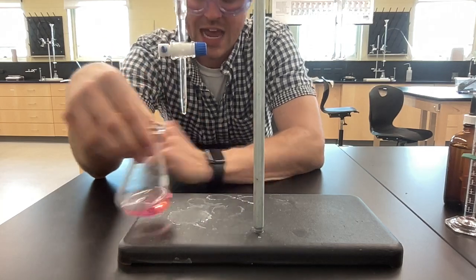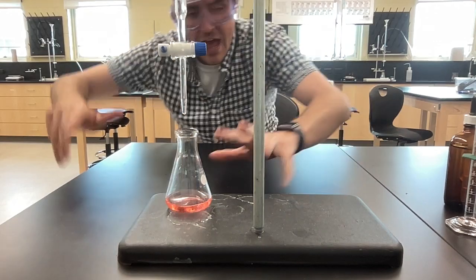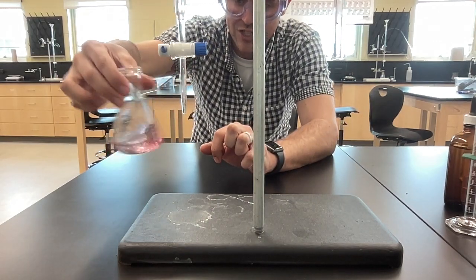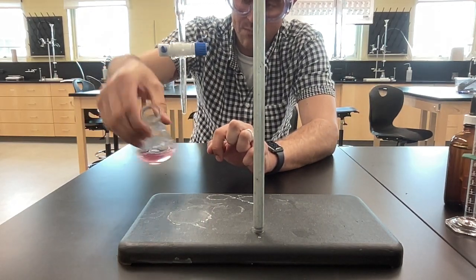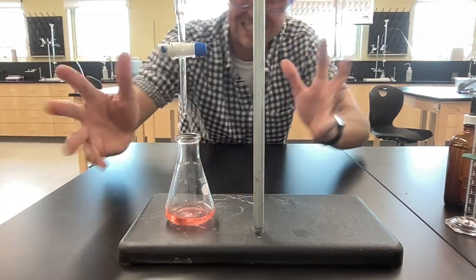Let's get up to 9 milliliters added. I'm at 9 milliliters. Oh, did you see the purple? That was kind of cool. Half was purple, half was red. Clearly a reaction is taking place. Purple is our base color, but right now it's still red, so it's still on the acidic side of pH.